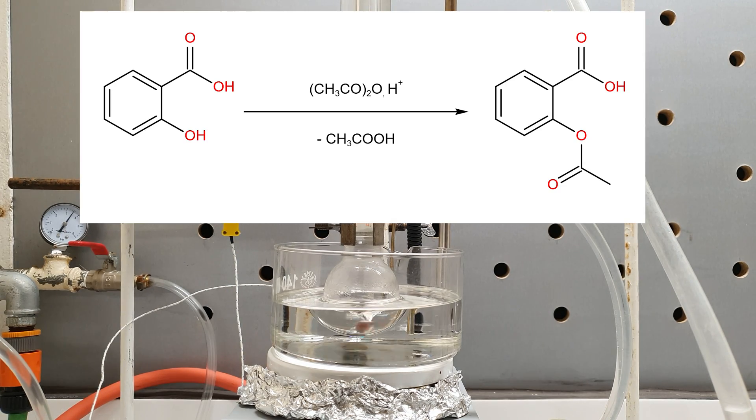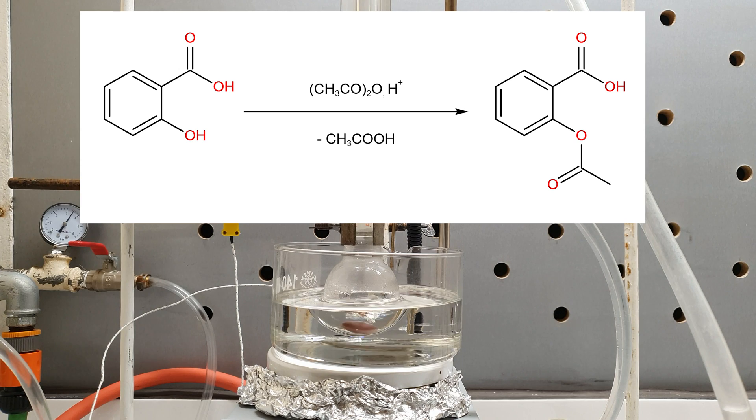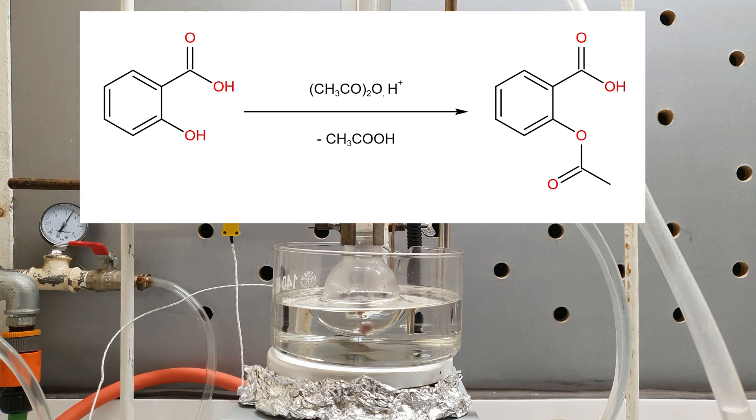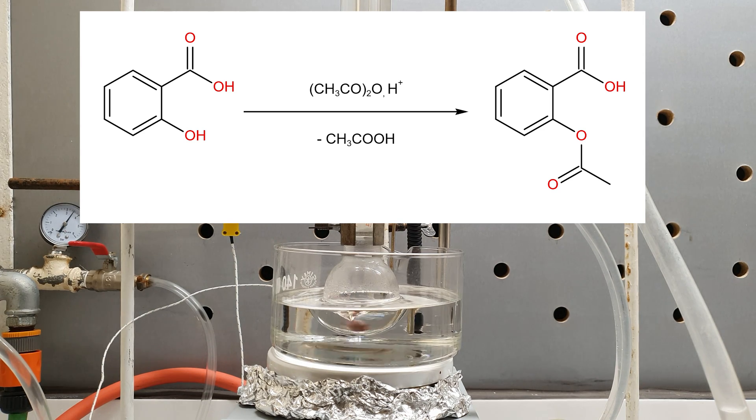What's happening here in terms of reaction is that the acetic anhydride acetylates the phenolic group of the salicylic acid. The sulfuric acid acts as a catalyst making the anhydride more reactive and the reaction go quicker. Note that the anhydride I'm using is much more than the calculated stoichiometric amount. That's because in this case it's a reagent and solvent at the same time.